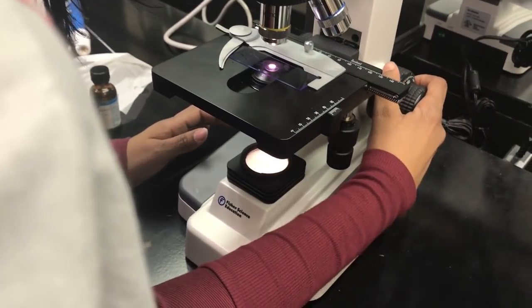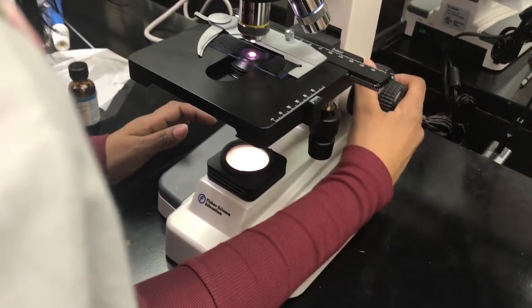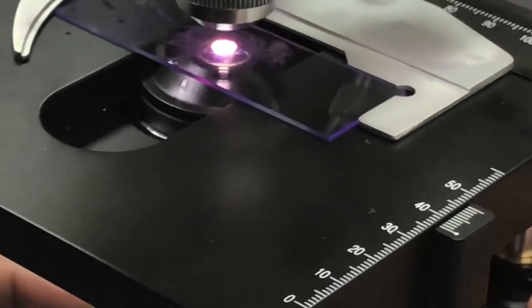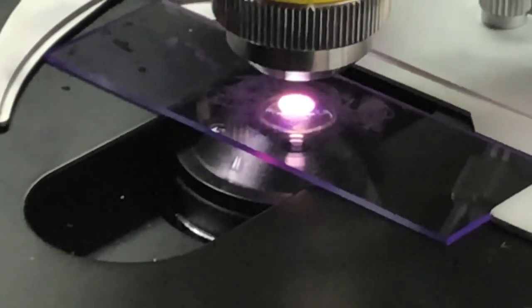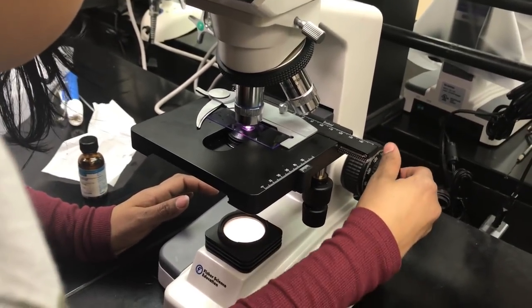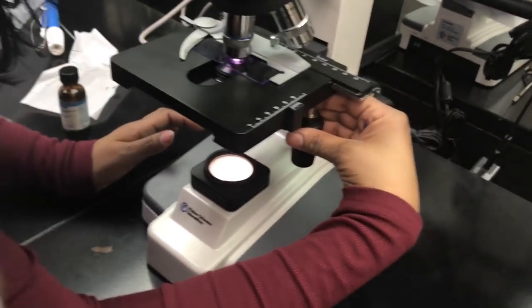All right, so I'm going to help Janiyah focus because, you know, she's pretty much 8. Jasmine is 11, so that's different. She can handle it. There's a lot of bacteria on here. That looks like staph too. We'll see.